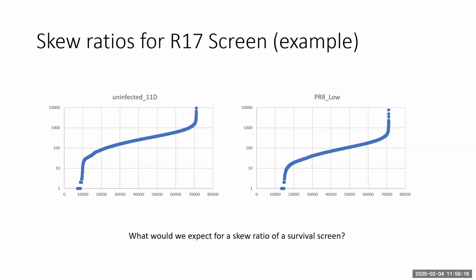And that's going to reduce your coverage of, say, the 20,000 coding genes that you're looking at in chicken. Any of those guides that are just not there, if they're an important gene that the virus would normally need, then you're not going to see it in the screen or in the results. This is still fairly reasonable.